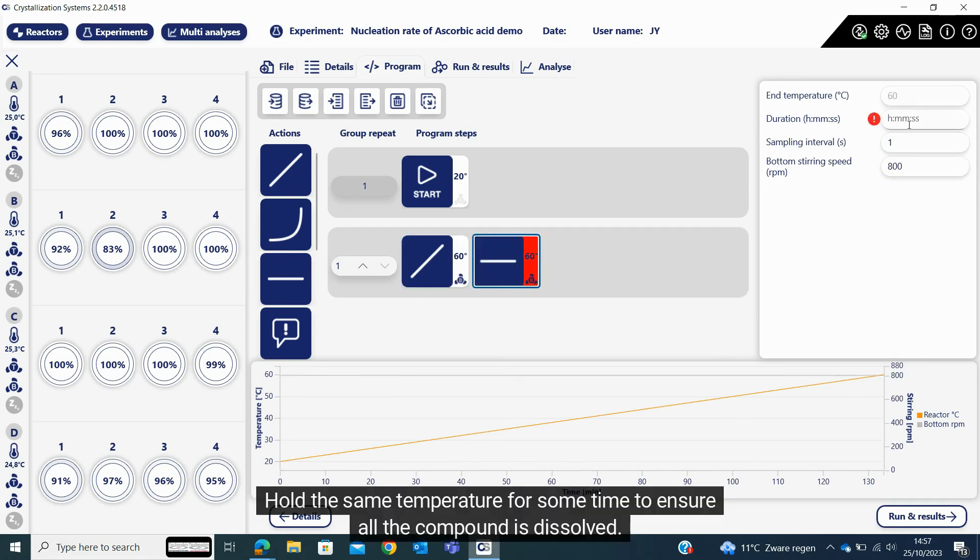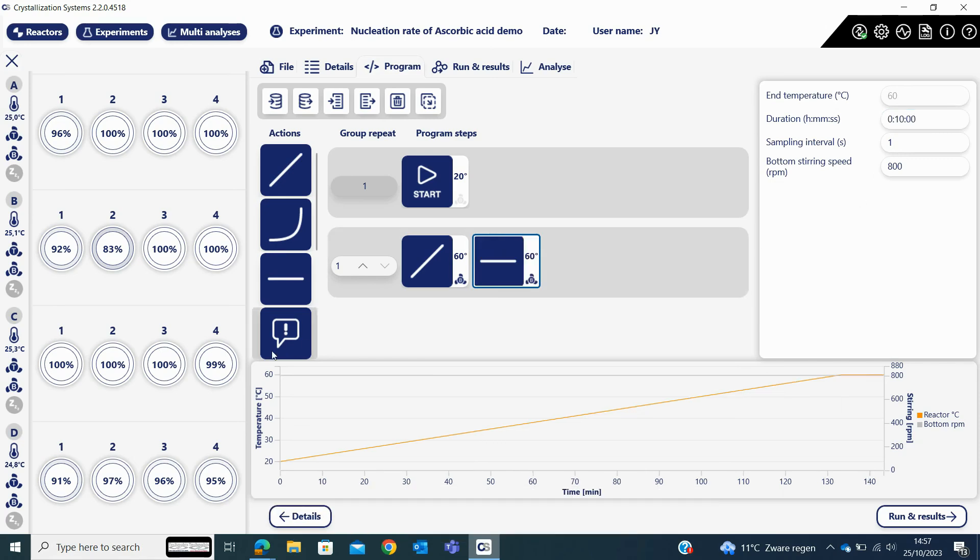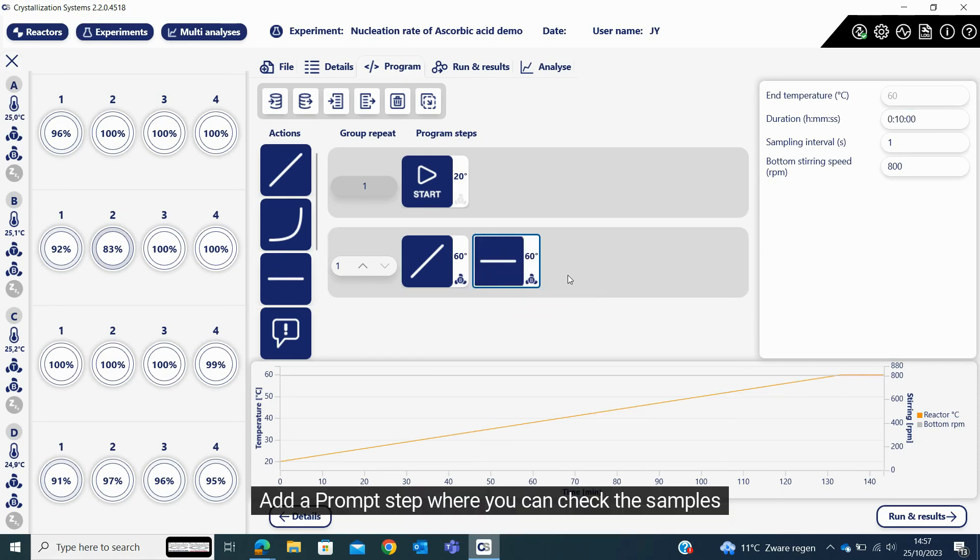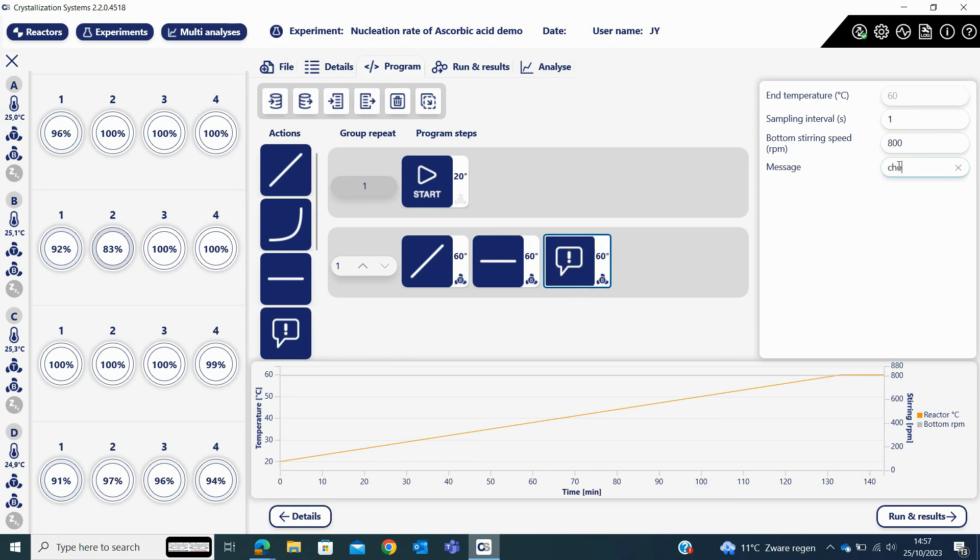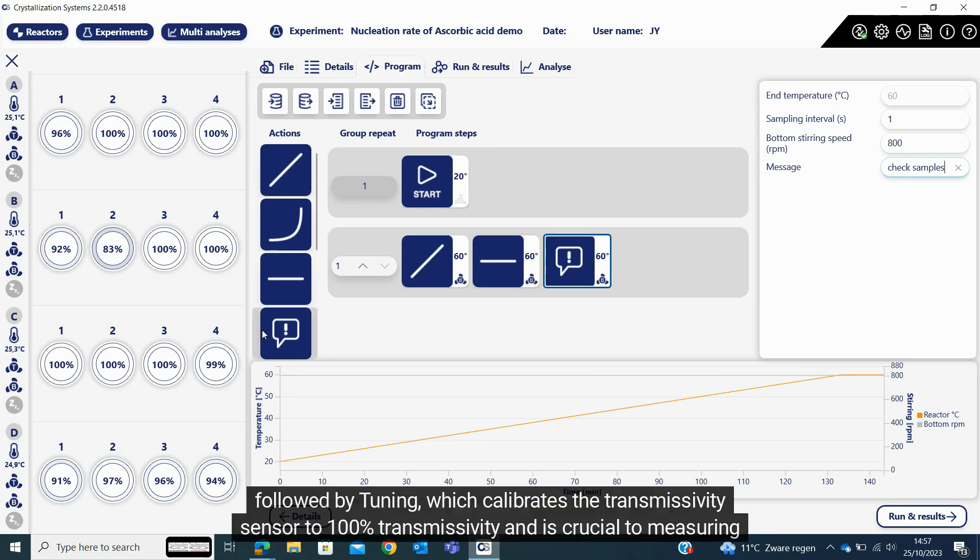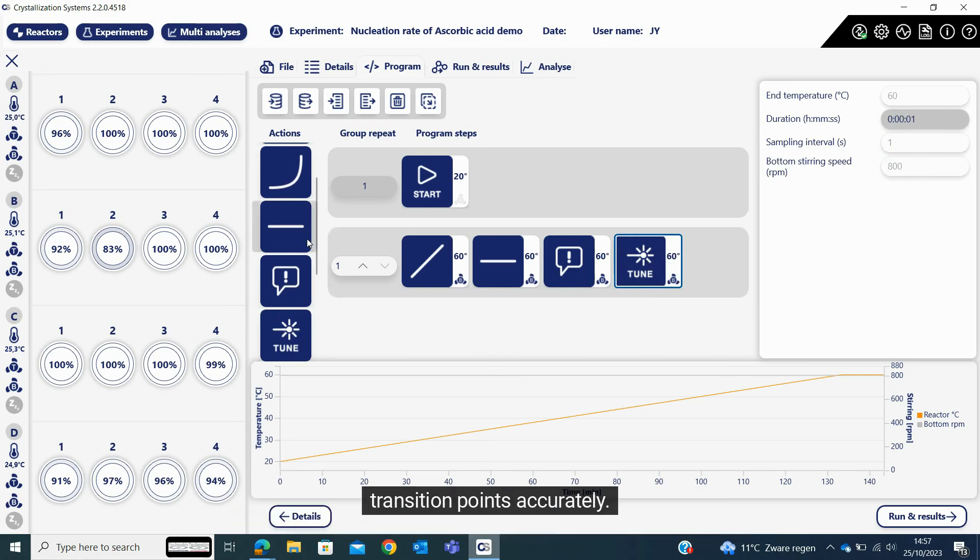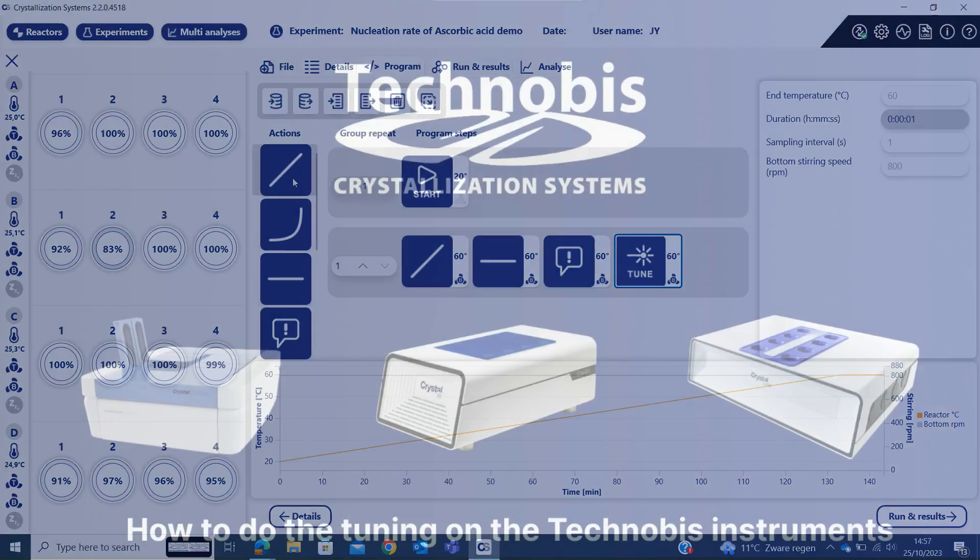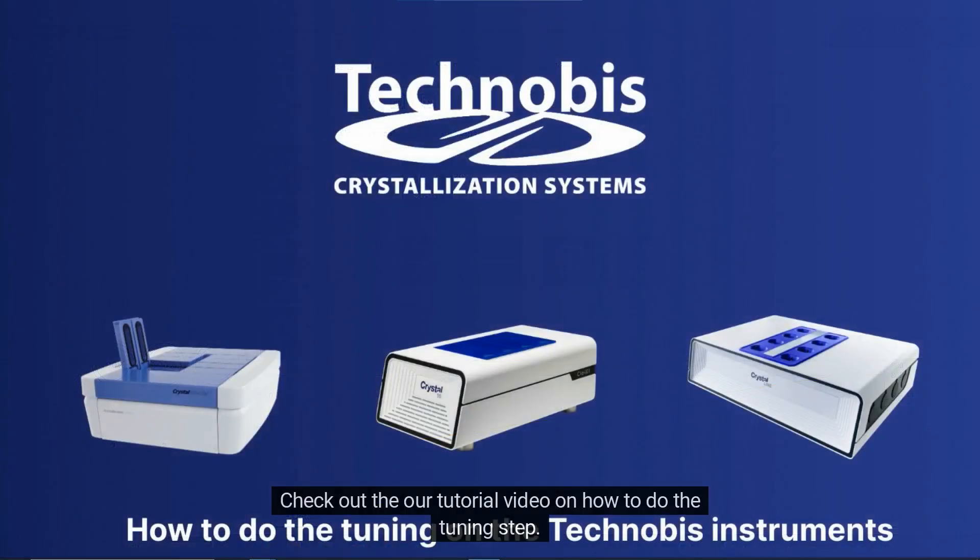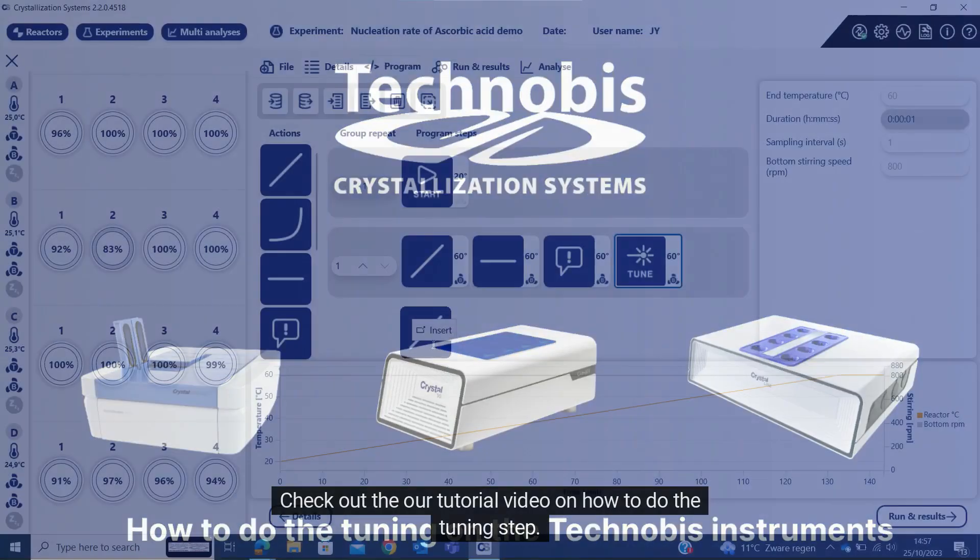Hold the same temperature for some time to ensure all the compound is dissolved. Add a prompt step where you can check the samples. Followed by tuning, which calibrates the transmissivity sensor to 100% transmissivity and is crucial to measuring transition points accurately. Check out our tutorial video on how to do the tuning step.